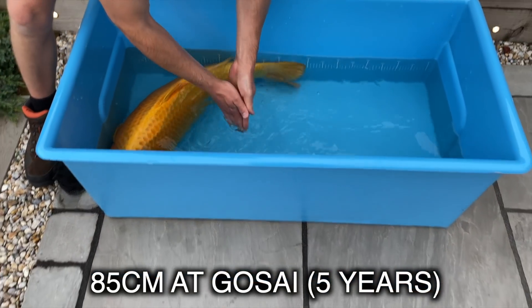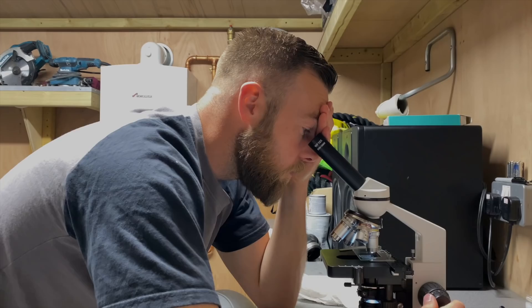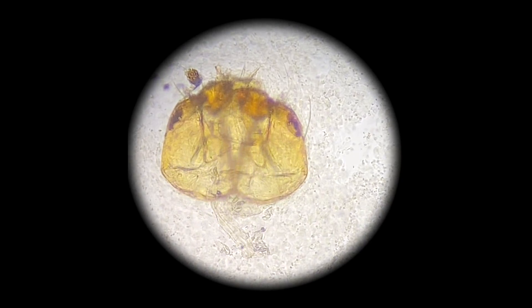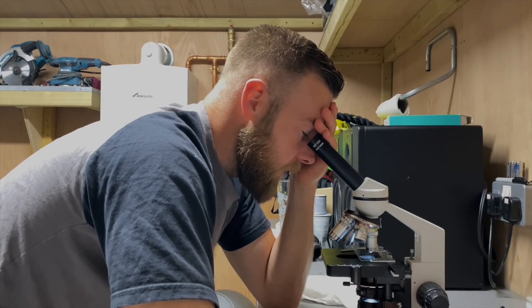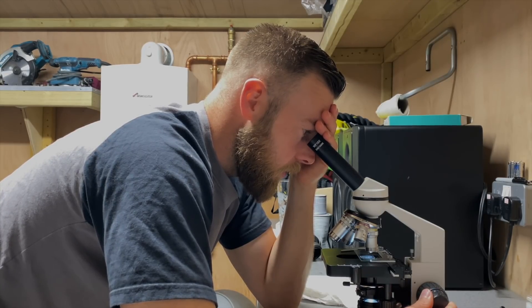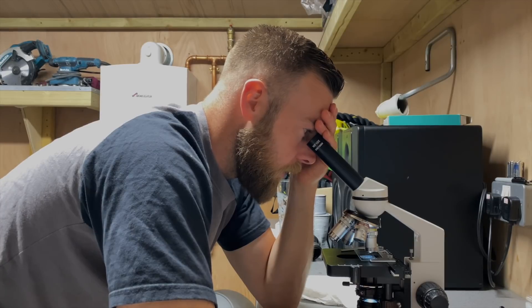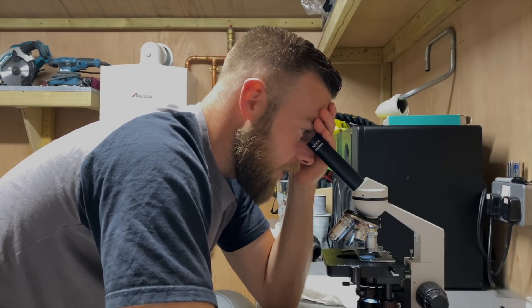85. Nice, not bad going. I've scanned every slide with 100x zoom, and any time I've thought there's potentially something there, I've flicked over to 400x zoom. But she's clean as a whistle. And I knew she would be — I knew I wasn't going to find anything.